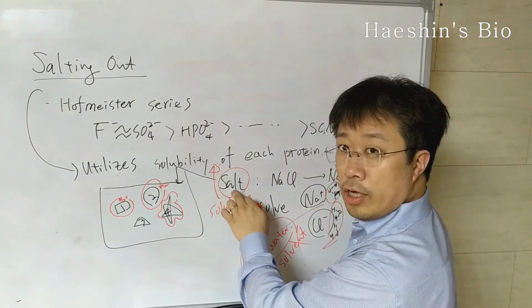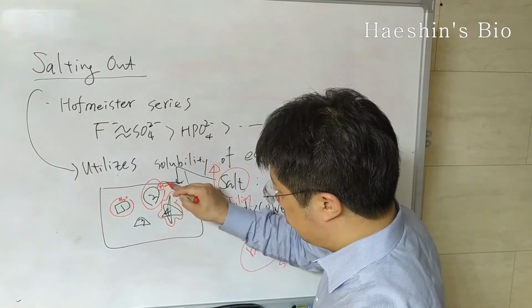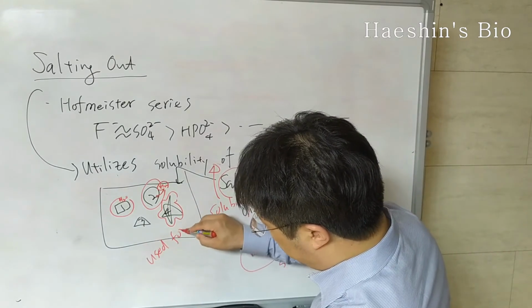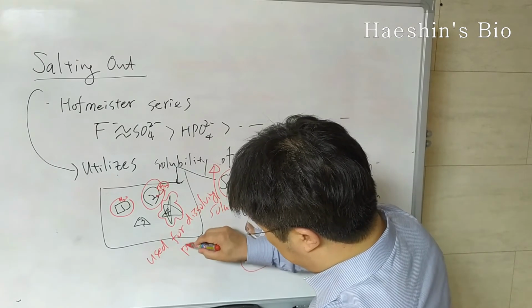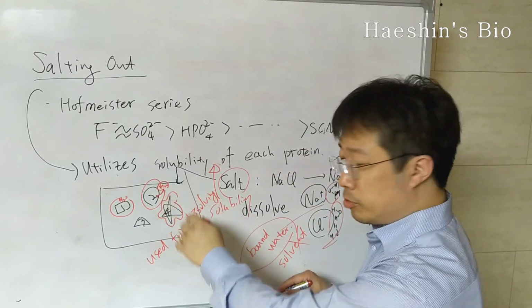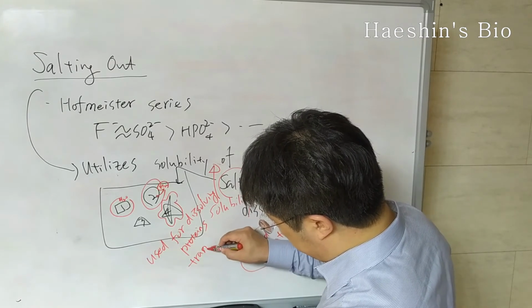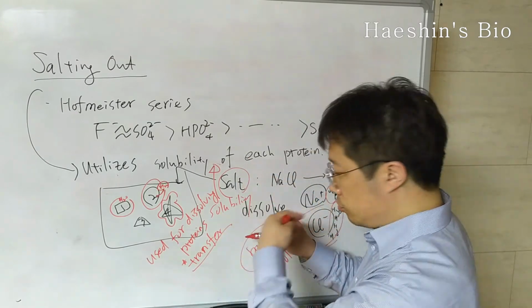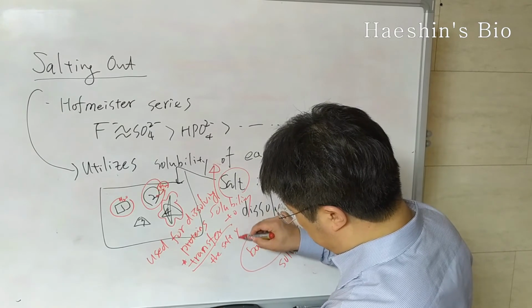But as you add more and more of this, now because solubility is higher, this water molecule actually used for dissolving protein, right? This is the previous water that dissolved protein. Now, transfer. So this is important, right? This is transfer to the salt. Salt you added.